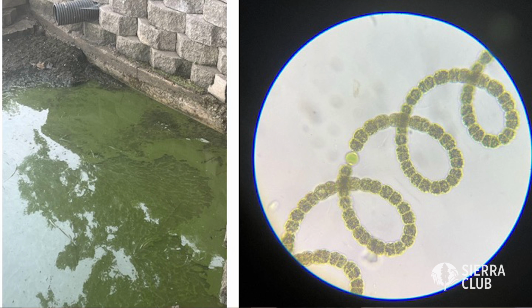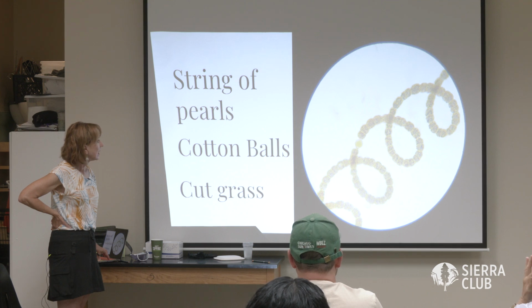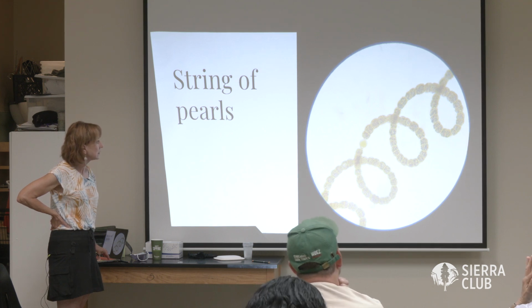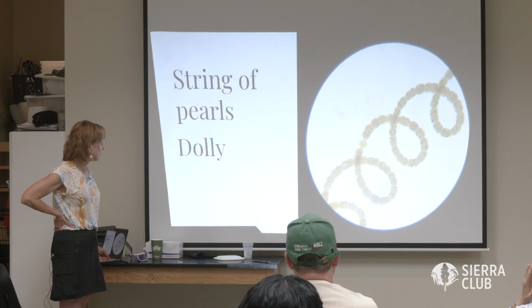All right, what do we got here? What do you think? String of pearls. And string of pearls is? Dolly, Dolichospermum. Yeah.